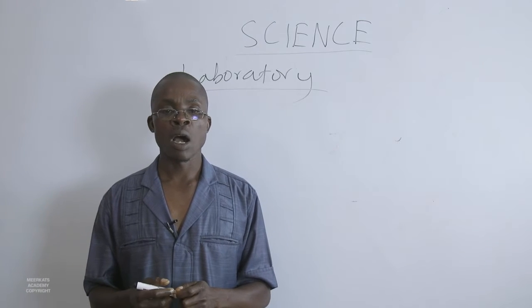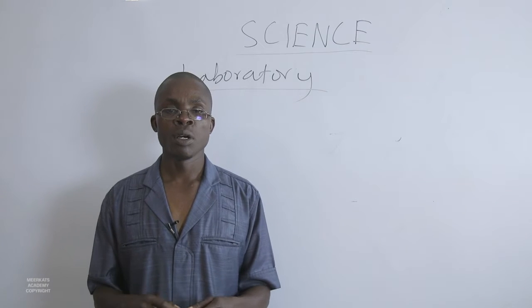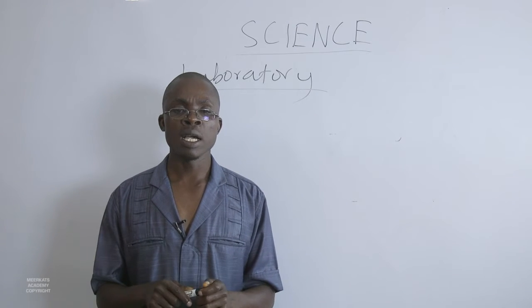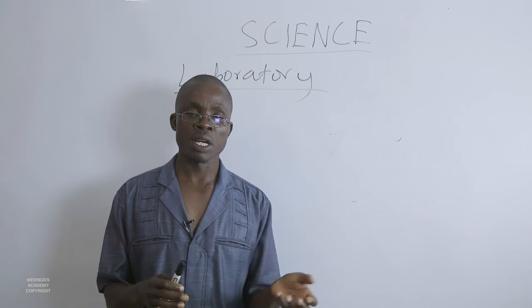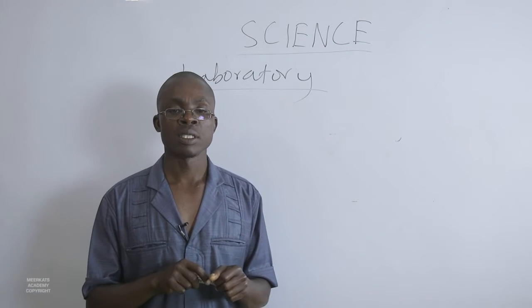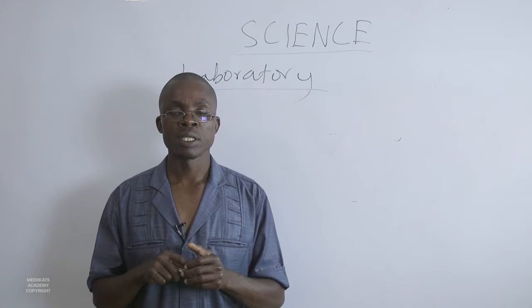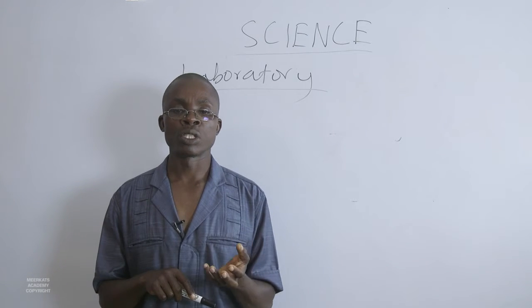And I want us to look at how special a chemistry lab is. What are the special materials, items, and apparatus that can be found in a chemistry lab? How do those items and apparatus work, and why do we think they are the best and not the others? How well should we use those apparatus? How well should we interpret the data gotten from the apparatus? And lastly, how to draw those apparatus?